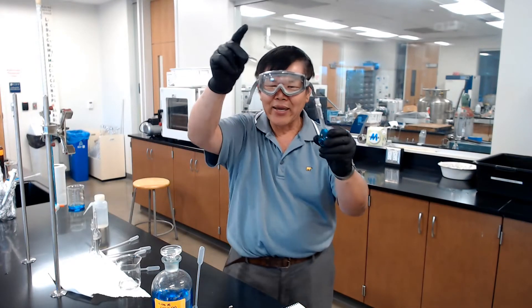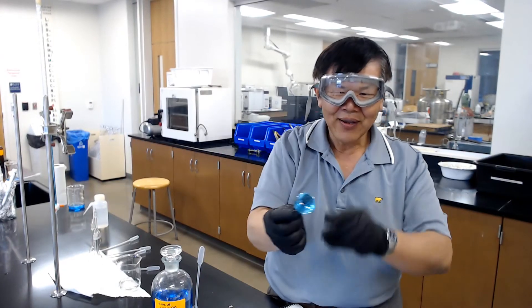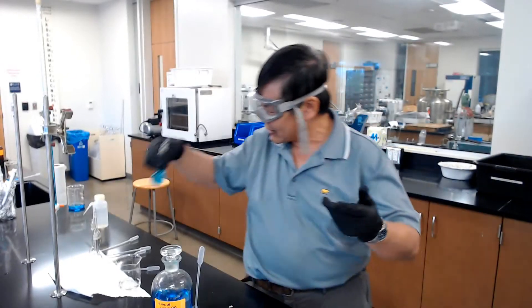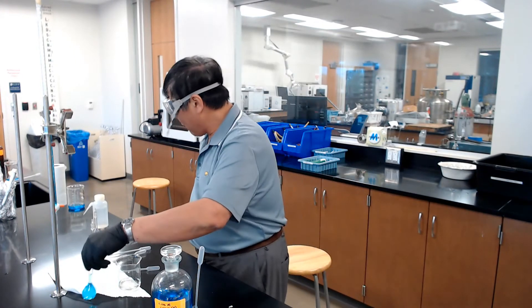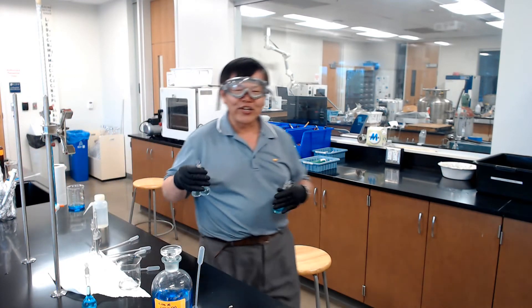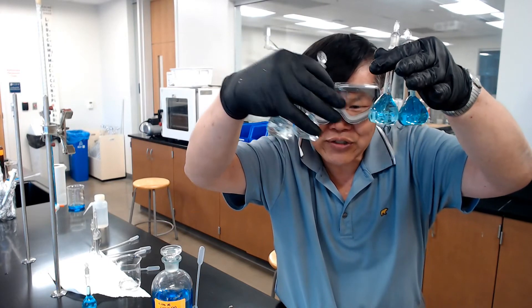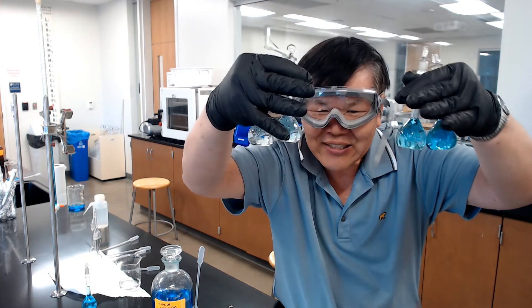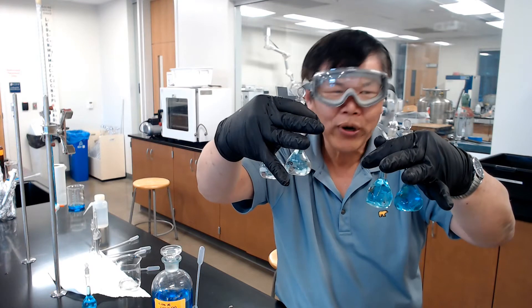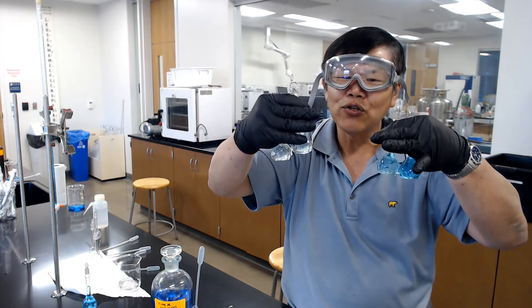Put the stopper back in and shake it like maracas to mix. Repeat this for all other solutions according to the recipe. Once done, you'll have four different solutions ranging from darkest to lightest. The fifth solution at 0.100 can be taken straight out of the buret. This concludes the preparation of the calibration solutions.